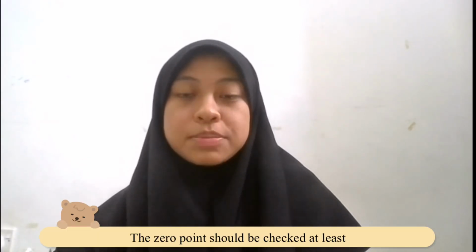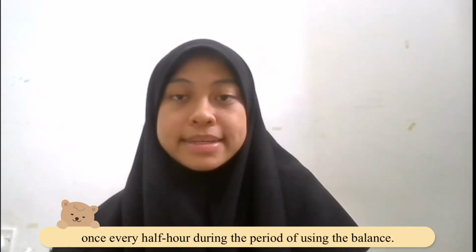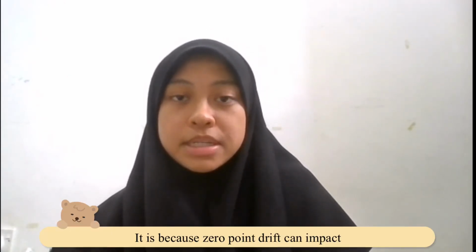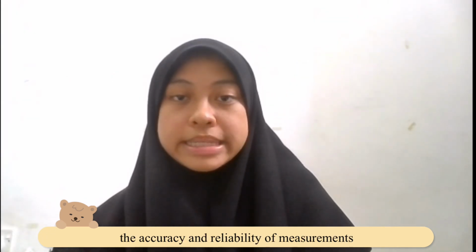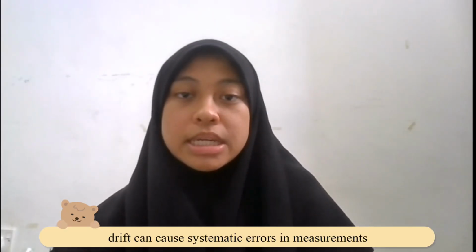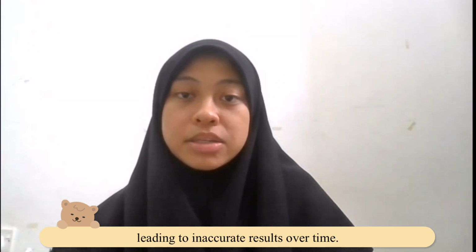The 0 point should be checked at least once every half hour during the period of using the balance. It is because 0-point drift can impact the accuracy and reliability of measurements, which is drift can cause systematic errors in measurements leading to inaccurate results over time.